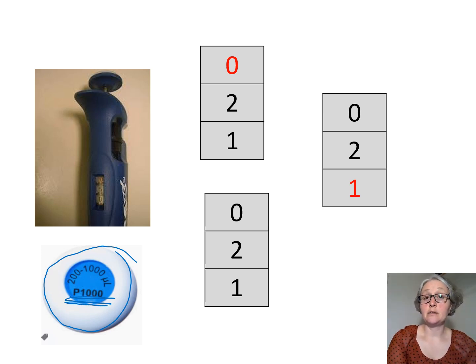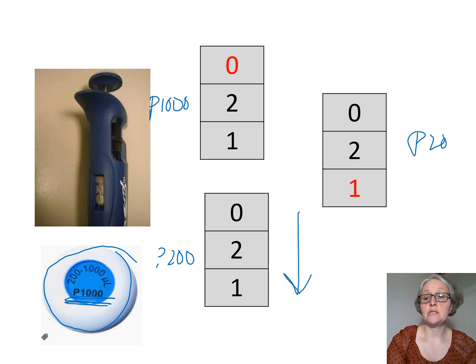Each micropipette is different. At the McKinney campus, the P1000 is going to have a red number at top in the thousands column, followed by the hundreds column and the tens column. The P200 will have 3 black numbers, and the P20 will have 2 black numbers followed by a red number. Please make sure as you read the micropipette, you're always reading down.